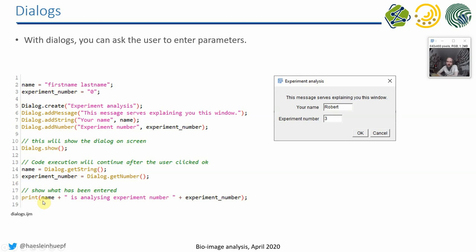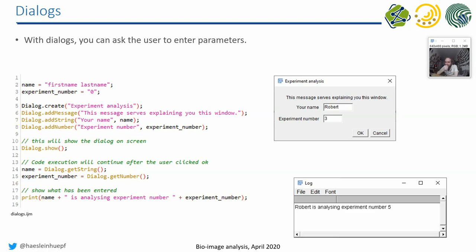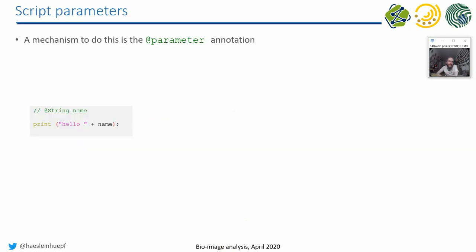It should then, when I enter Robert and the experiment number three, it should then... It should actually say three here, so maybe the screenshot is simply screwed up.